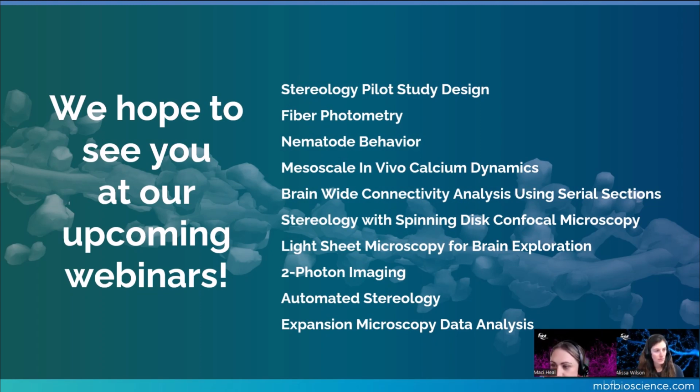Also have a question regarding detecting larger vessels and any tips for reconstructing those larger vessels. There's a few things I would suggest. It really depends on the data, so I'd love to take a closer look at your specific data, to the researcher who asked this question. But off the top of my head, I would check out the typical process width setting. It's available in the user guided mode, but it will carry over into the automatic mode.